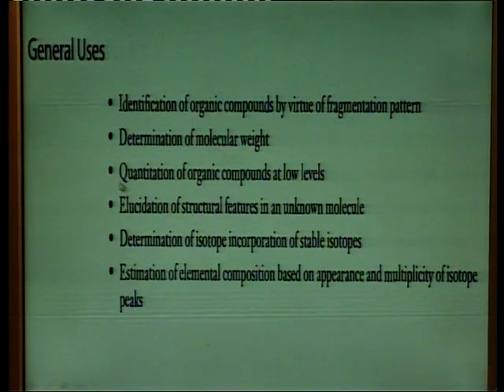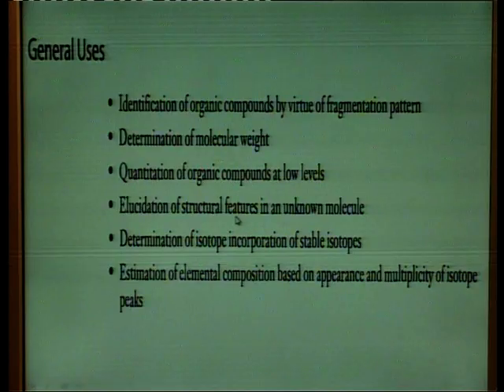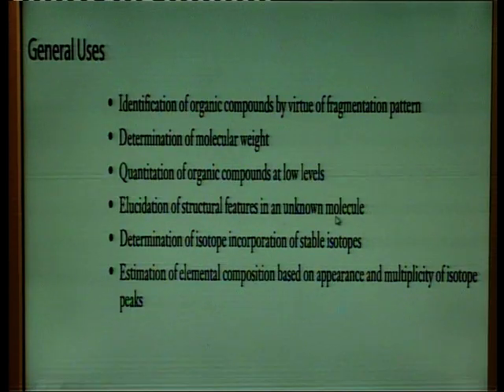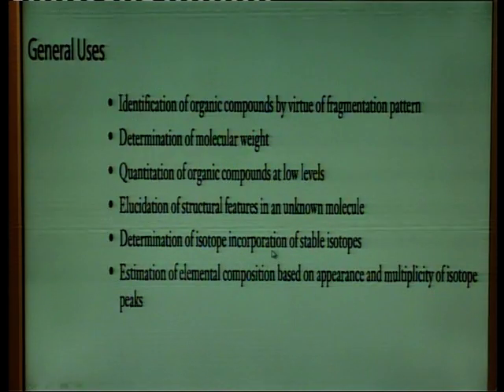Now, these are the general uses. They are used to identify organic compounds by virtue of the fragmentation pattern, determination of the molecular weight, quantitation of organic compounds at a low level, elucidation of the structural features of an unknown sample, determination of the isotopic incorporation of a stable isotope, and estimation of the elemental composition based on the appearance and multiplicity of the isotope peaks.